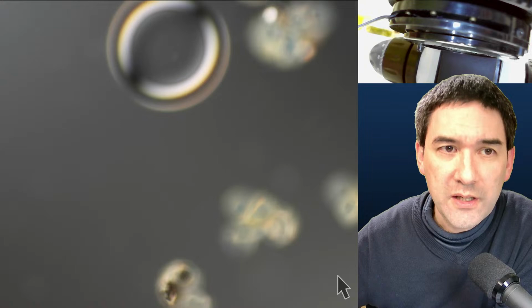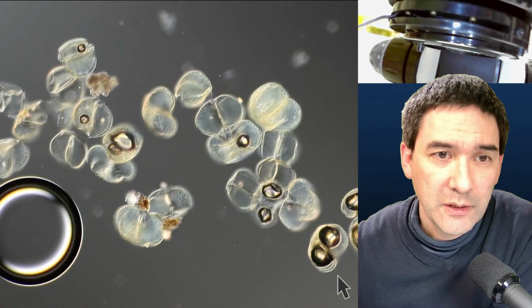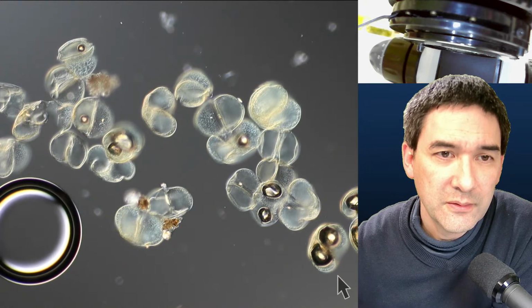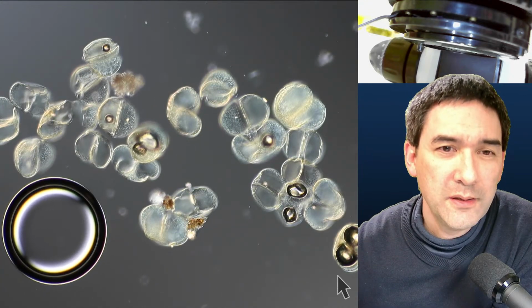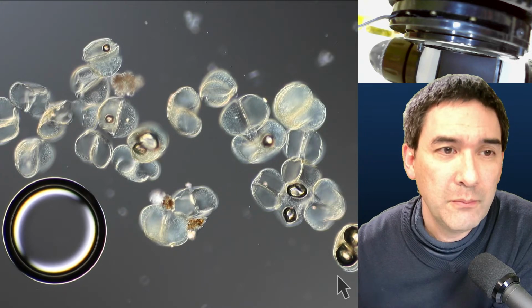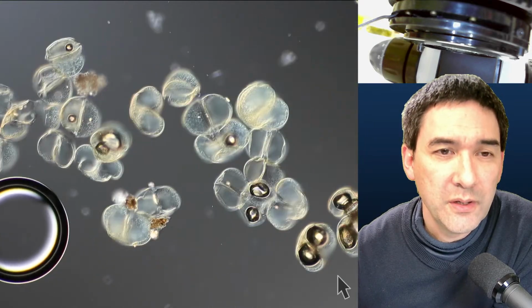So the next one is Euparal, and that is the mounting medium that is often used for insects. Normally it takes 6 weeks to dry. Again very blurry over here. But you see, again a little bit different. There are still air bubbles in there, a little bit, but it seems to make the specimen more transparent. That's also something that we've already seen before with insects, that they also become more transparent, and here as well.